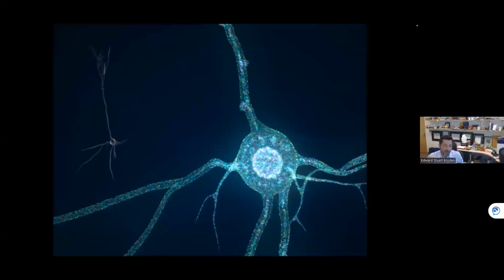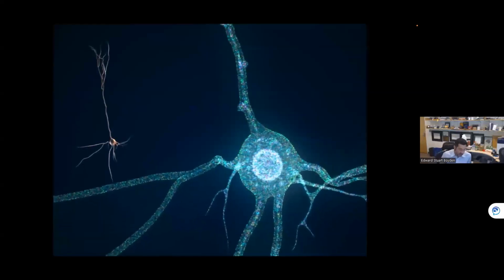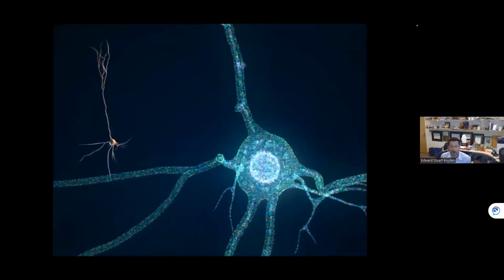So in a nutshell, what we want to do is to take a cell like the one on the left of this cartoon and pull apart the building blocks of life so they look like something on the right, a constellation of biomolecules hovering in space. Their relative organization is preserved, but they've all been pulled apart from each other. So two biomolecules that were touching are now some minimum distance apart, and two biomolecules that are some distance apart have been scaled up by a linear factor.